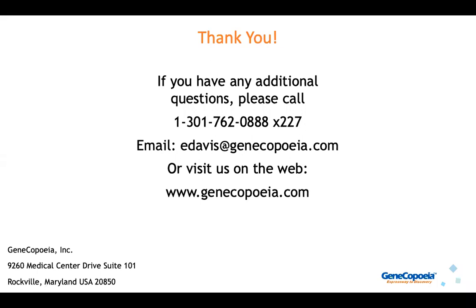Next question: why do you only have pre-made lentivirus expressing luciferase and GFP? Do you have any other markers available? Well, we don't have anything pre-made yet expressing other markers.